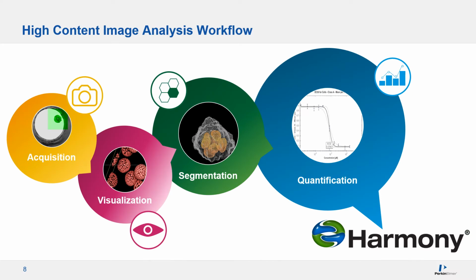Moving on, let's focus on the most important part of the workflow, which is high content analysis. And it is done using one software called Harmony, whereby you can perform image acquisition, data visualization, segmentation, and more importantly, quantification in 2D or 3D.